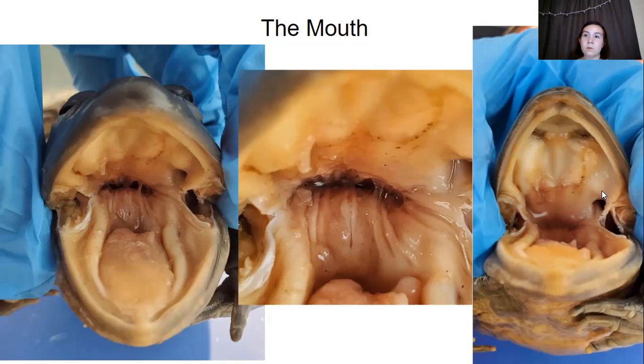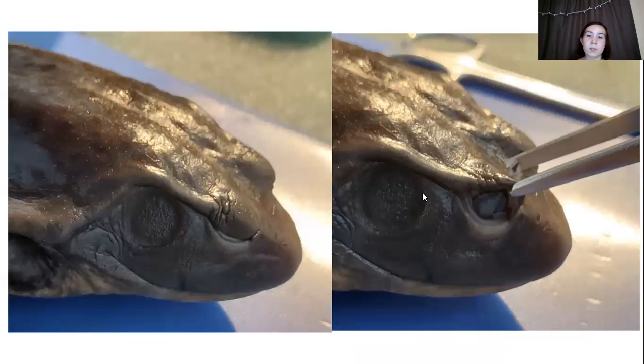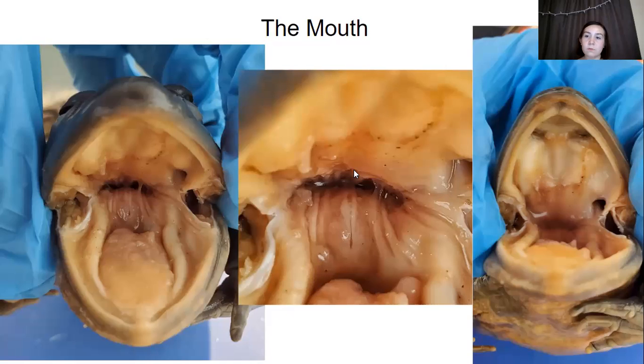Okay, and then we have the eustachian tubes that are on this end. This just helps protect the membrane, the tympanic membrane, as mentioned here. They're connected to this part, and they just help protect it from any strong vibrations. They'll do this by putting pressure. And so that's why you might see some frogs croak or have larger cheeks, so to speak, because they're actually trying to fix the pressure of their ears or their tympanic membrane.